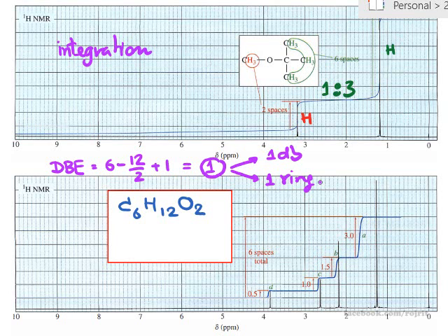So what you have to do is count the types of hydrogen atom. As you can see, we have 4 different signals, right? So that means 12 hydrogen atoms in the molecule, composed of 4 types of environment, right? With the ratio of 0.5, 1, 1.5, and 3, right?